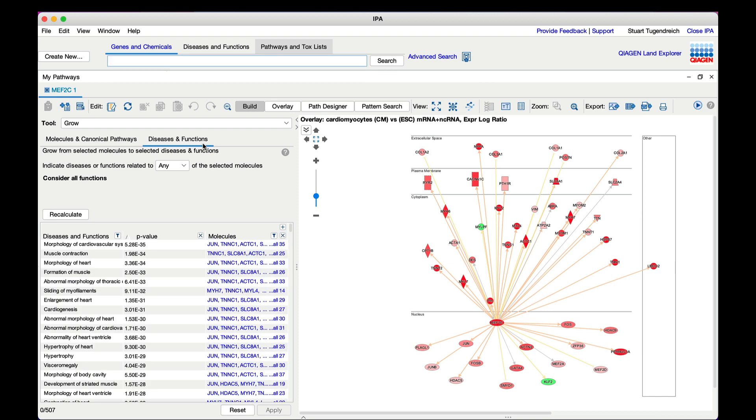Now you get a table that lists diseases or functions and associated p-values. You can add one or more of them to the network to connect to its associated genes and visualize how the network is predicted to causally impact it.